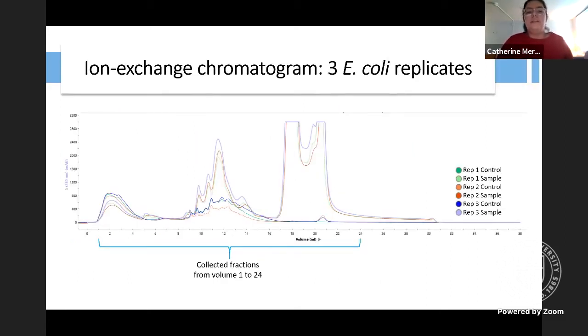So here is an image of our ion exchange chromatogram of all three replicates we performed of this experiment using ion exchange. The fractions collected were between 1 to 24 mLs, which was dependent on our flow and gradient method. The working method was the same for all three. Additionally, what we can see in this graph are the different peaks, especially in the control, indicating that because of the absorbance we see on the y-axis at 280, that there is protein in that fraction, indicating there's likely some interaction going on there.